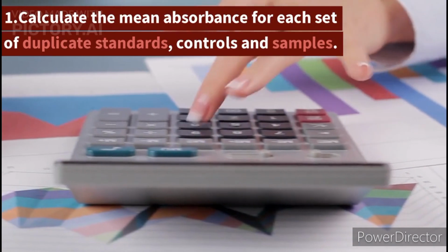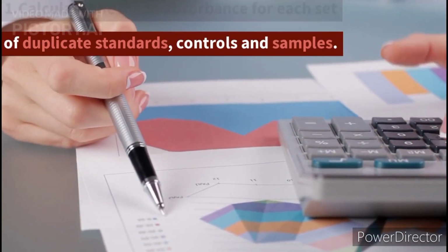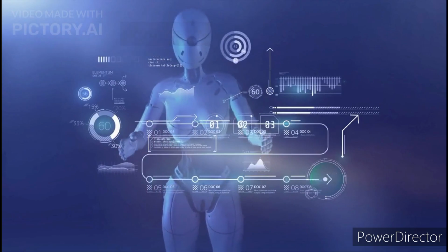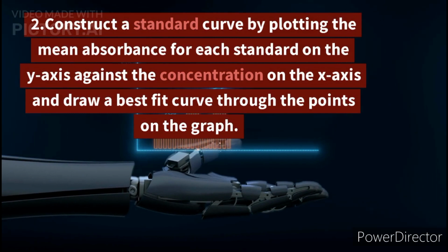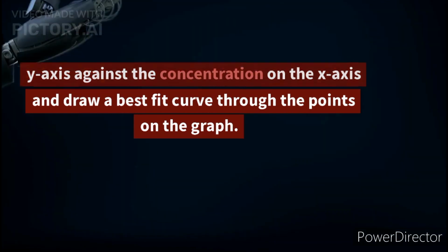Calculation of results. 1. Calculate the mean absorbance for each set of duplicate standards, controls and samples. Subtract the mean 0 standard absorbance from each. 2. Construct a standard curve by plotting the mean absorbance for each standard on the y-axis against the concentration on the x-axis and draw a best fit curve through the points on the graph.